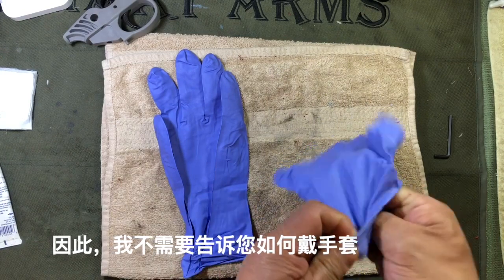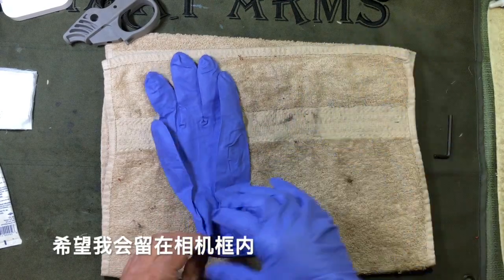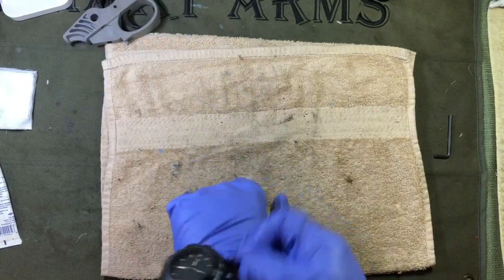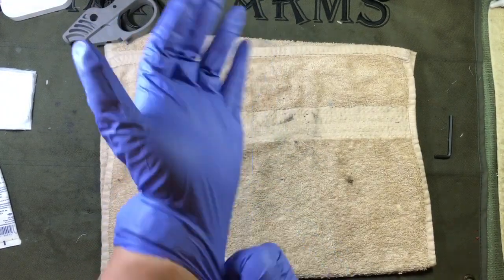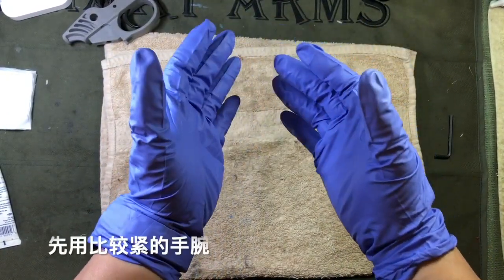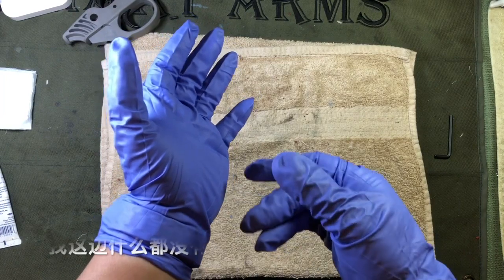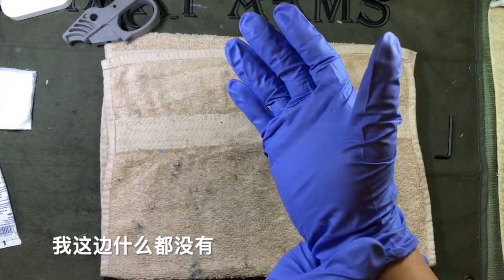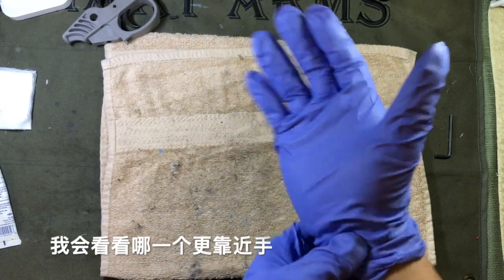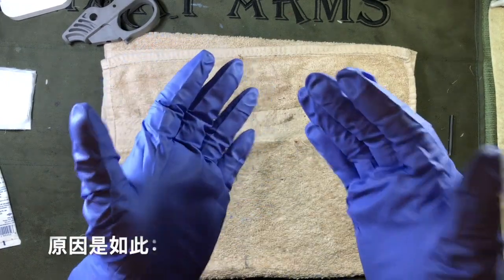I'm going to put on my gloves here. Now I'm going to make sure that I start with the wrist that is most constricted. Notice I have a wristwatch on this side but nothing over here. If I was wearing an ID bracelet or anything on either side, I would look to see which is closer to the hand — the thing that's closest to the hand is the side I'm going to start with.